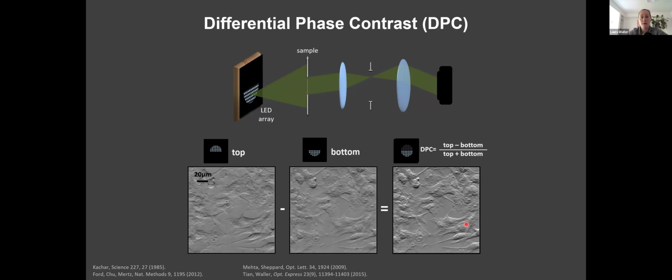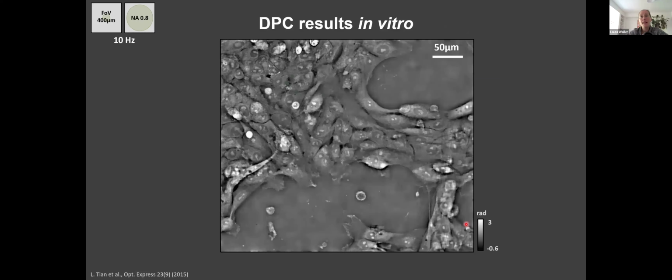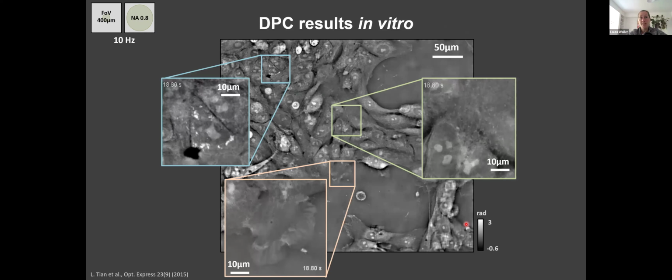Really close to that. We model it a little bit more carefully. But then I can just take the inverse first derivative, just integrate, and I can get quantitative phase across the cell from just a couple of images. We actually take 3 or 4 images with different orientations of the circle just to fill in some gaps in the Fourier space. But then you can get really fast quantitative phase imaging. And these are some examples of vesicle tracking and things that were moving in the cells that were previously too fast to be seen by other methods that I had worked on previously. So I was really excited about this method.